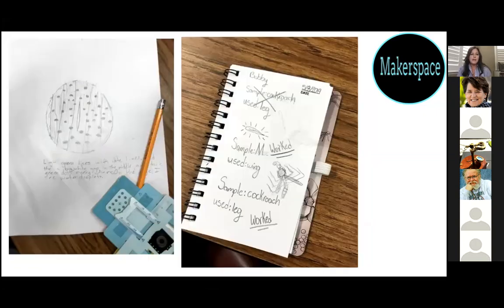They worked on that, and then also sketching and taking notes, not very structured at this point in my Foldscope journey. But the kids just naturally wanted to draw and doodle.